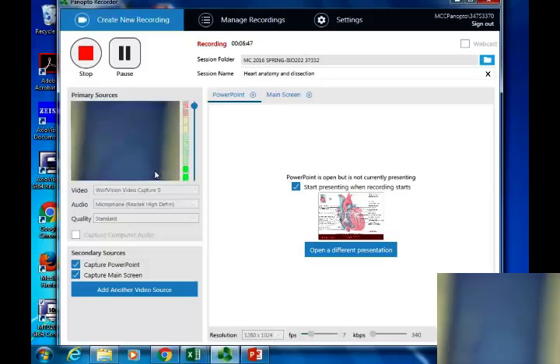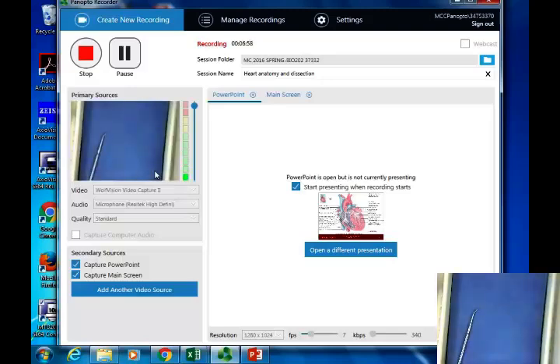The reason that I'm trying to use the display like this is I'm trying to create another video like we have for the Panopto so that maybe you can review this later on. This is the first one that we're shooting in the lab though. So in the recording, you should be able to see the picture from the PowerPoint over on the right side, and you should be able to see the video on the left side. And with any of those videos, when it has the camera capture on the left side there, I think in the recording you can actually click on it and expand it. So if you want to view that exclusively, you can, which will be important when we're looking at the dissection ones here. That way you can get a better shot at it than that little view that you're getting right now.